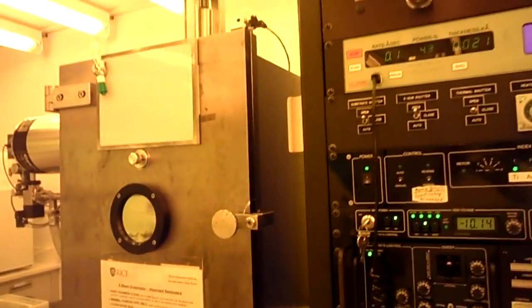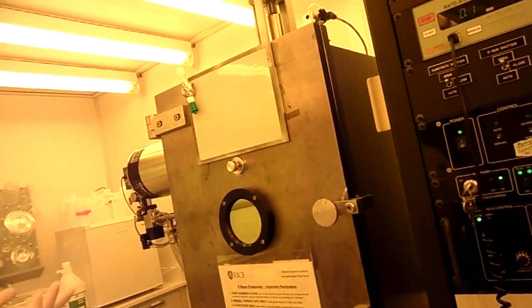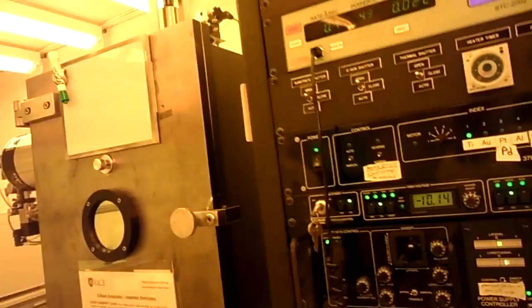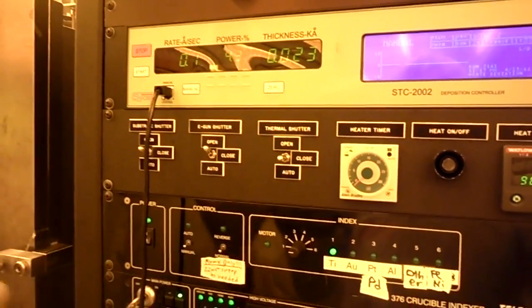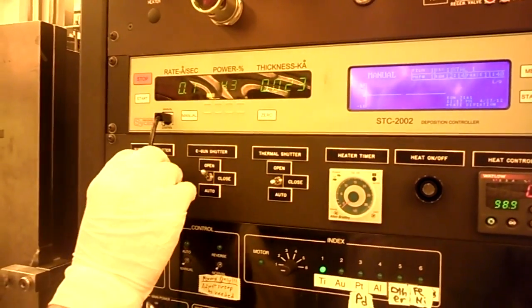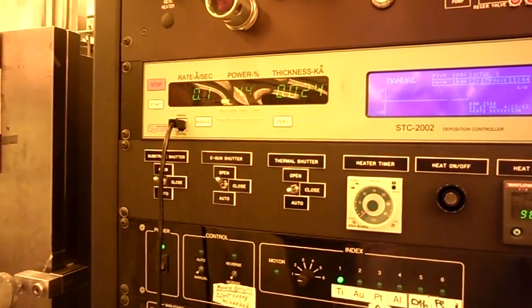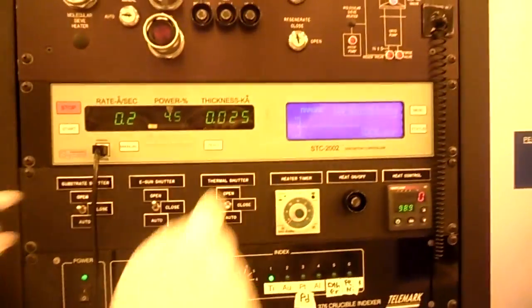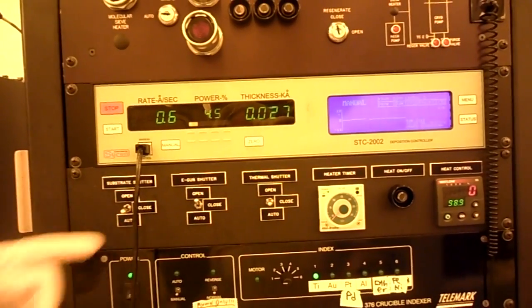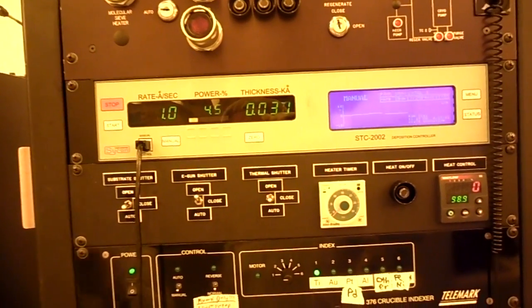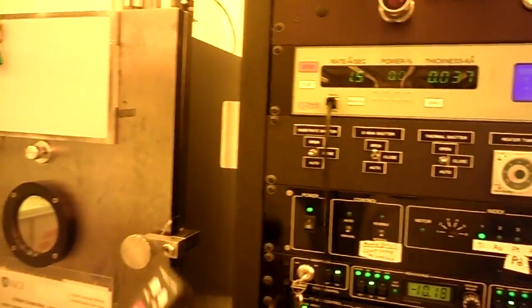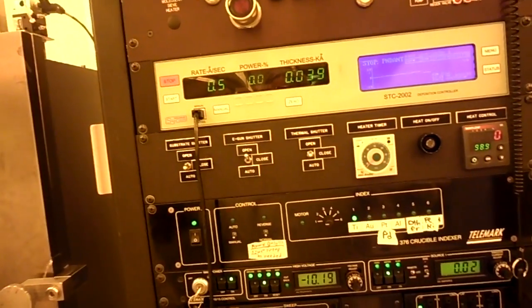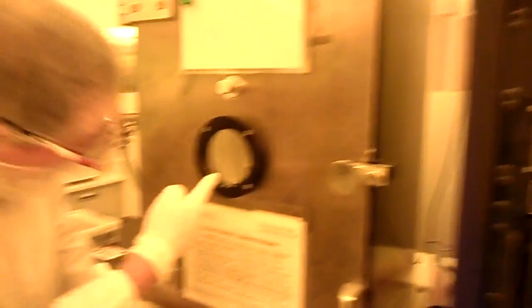Anyway, so we're running. We could stop this whenever we saw fit. The next person is going to come along soon, so we should go ahead and talk about shutting down. So, this is coming close to two and a half nanometers. And this is, again, not a great film, but this is for demonstration purposes. So, when I'm ready, I could increase this power a little bit to try to get it to evaporate more quickly if I wanted to. When this goes to 2.5, I'm going to stop it by closing the shutter first, which stops the deposition, and then I can stop the power. Stopping the power doesn't stop the rate automatically because it's still very hot. There's no power hitting it, but it's still glowing. And if we had a good melt, it would still be melting. And so you want to close the shutter because that tells you, even though it's telling me I had a thickness of 4.2 nanometers now, I actually stopped it at 2.5.